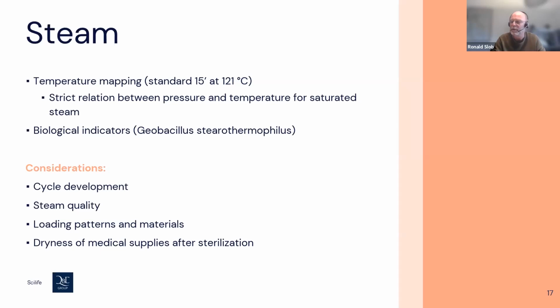You must be sure that everything within your sterilizer or fermenter is reachable for the steam, so don't pack everything together, because then you create a dead space. Also, don't try to sterilize big things at the same time as small things. If possible, group similar items together, because then you have a more uniform way of working within the sterilizer.